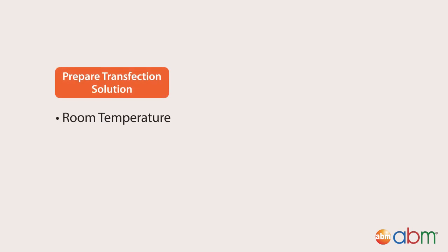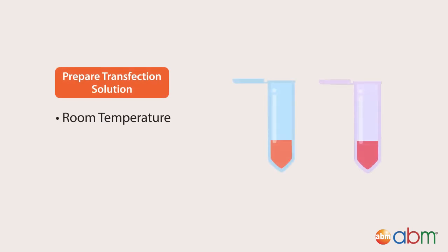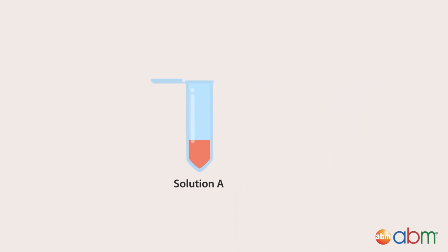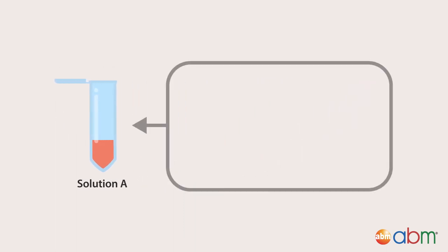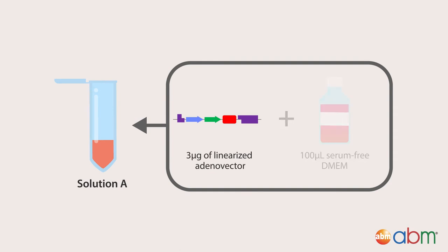At room temperature, prepare two solutions: solution A and solution B. To make solution A, mix 3 micrograms of your linearized adenovector and 100 microliters of serum-free DMEM. Incubate for 5 minutes at room temperature.